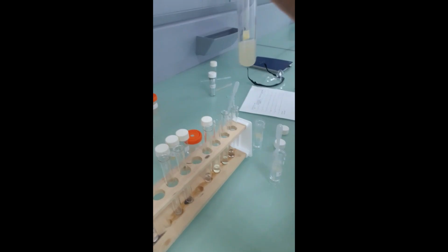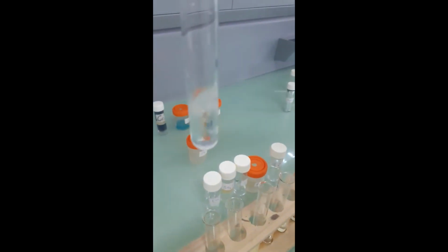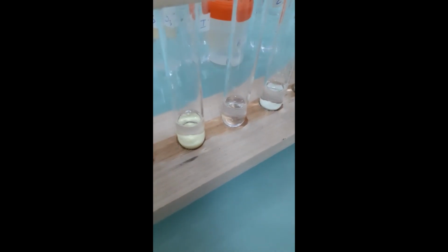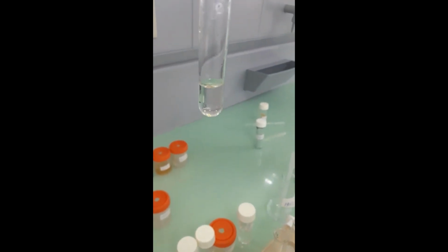Now we have the carbonate. To one part we're going to add the nitric acid. To the other part, we're going to add ammonia solution. Okay, so take your observations.